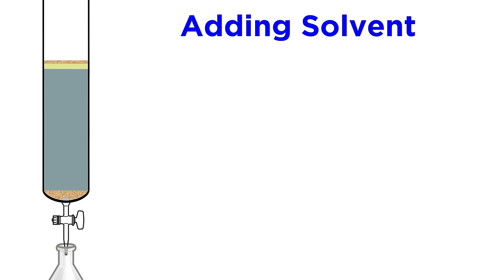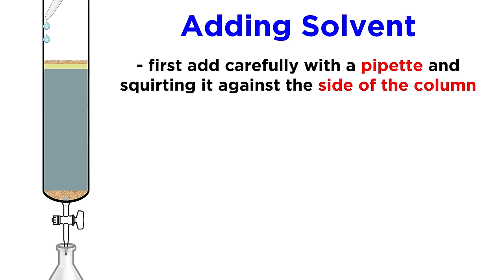Now we add the solvent. At first, we have to carefully pipette the solvent into the column, squirting it onto the sides at the top so that it gently flows down. We do not want to disturb the sand or the gel whatsoever. Do this until the solvent level is several inches above the sand.